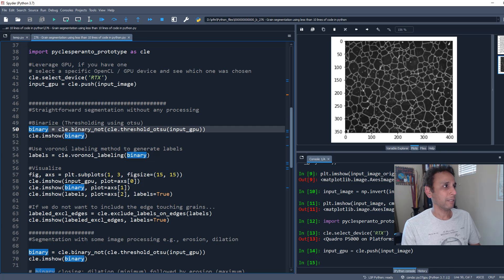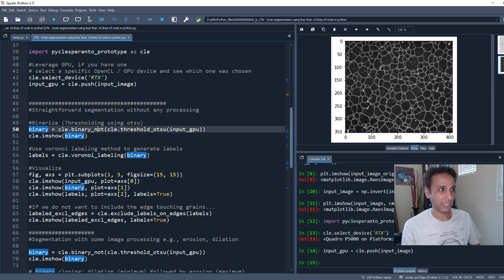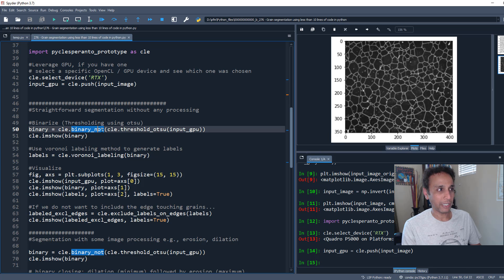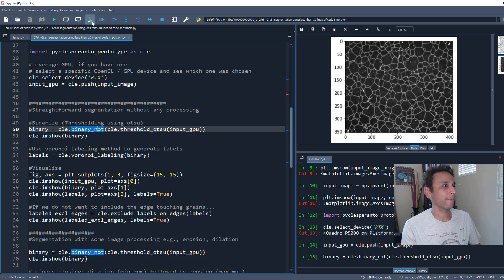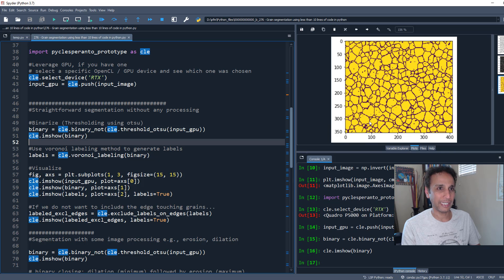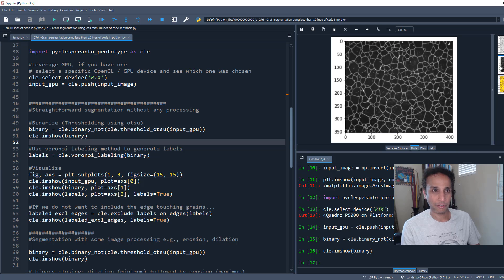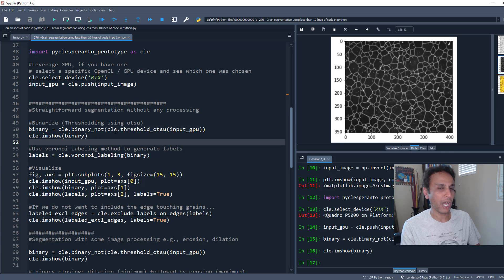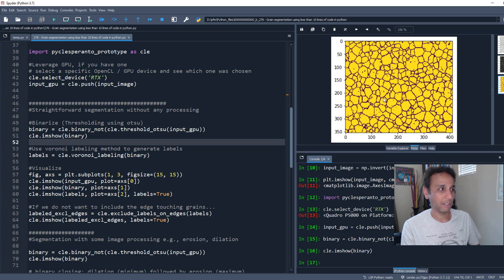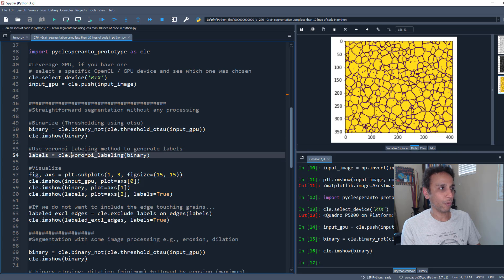Step number one: let's threshold this image, binarize it using Otsu. Within ClassPeranto there is binary_not. Let's do that and show it. I binarized this image and did the binary not, so you have this image clearly showing your grains.